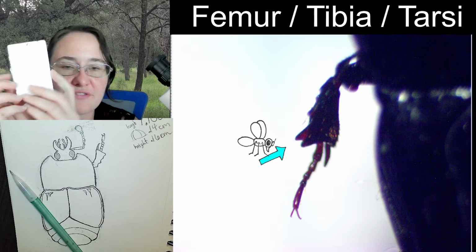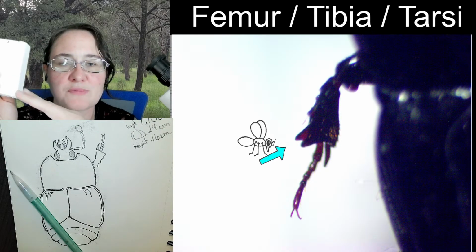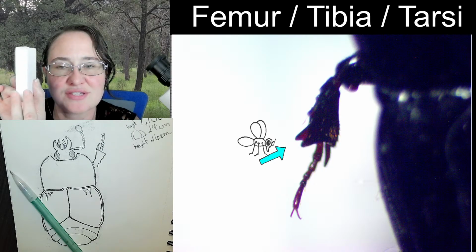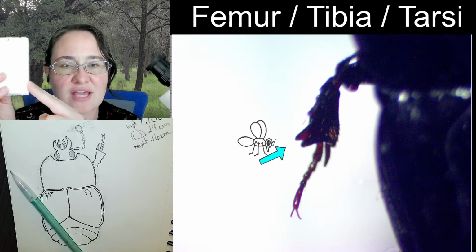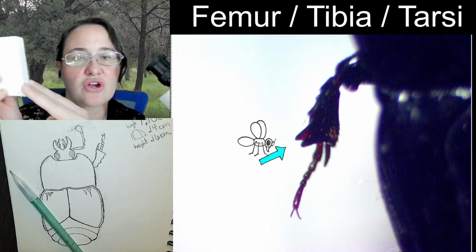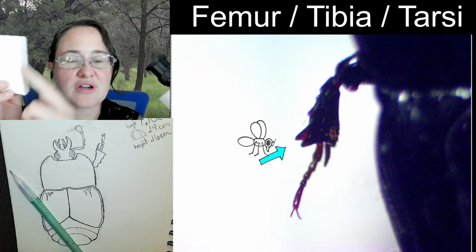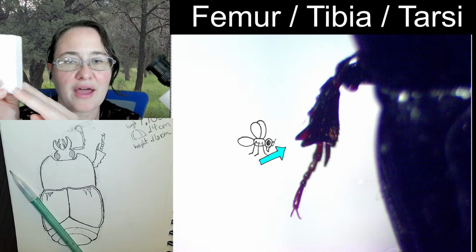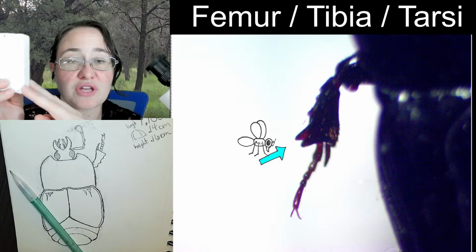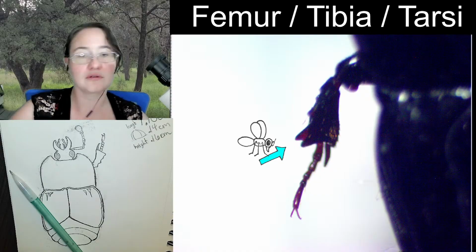So, if this piece of styrofoam was the tibia, those tibial spines are coming off of the same place. Just one is on the close side and one is on the far side. And we're tilted like this. So, you can actually see the width of the side of the tibia by the fact that you can see both of those spines. Because if we were looking at it from a perfectly lateral perspective, you would only be able to see one.